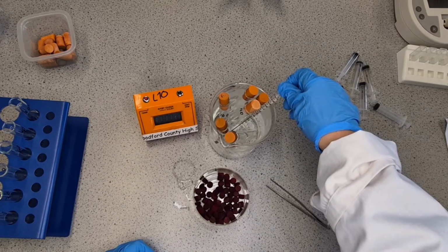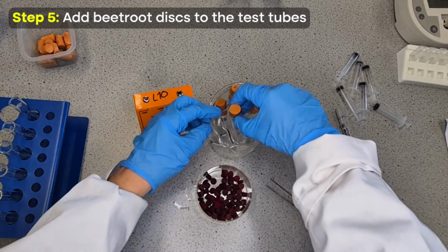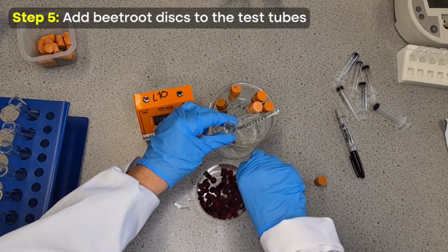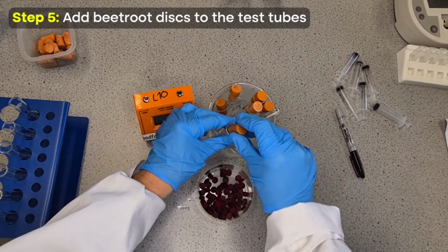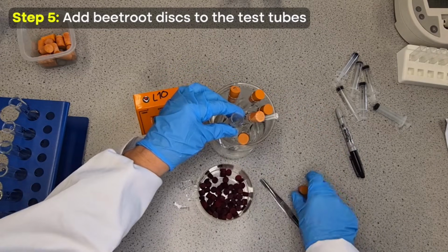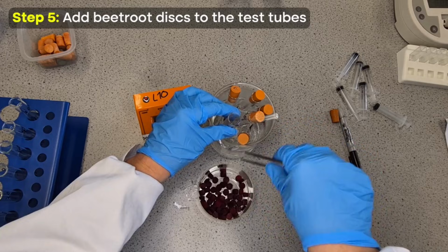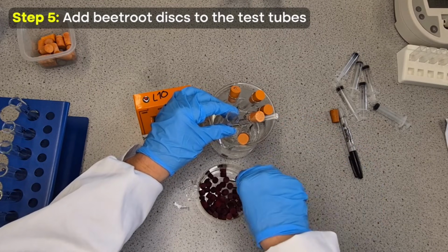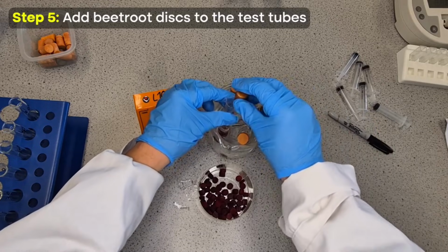Let's also just double check. We're about 33, so I'm going to add a splash more hot water, and I'm going to go for 3 discs each. If they're working in pairs, that'll be better so they can do this quicker, because otherwise the timings are going to be slightly off for some of them, in the sense that the ones that go first will have more time than others.